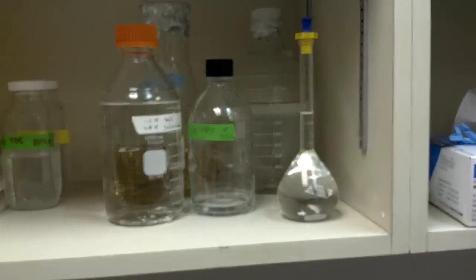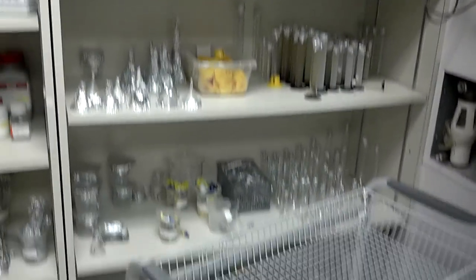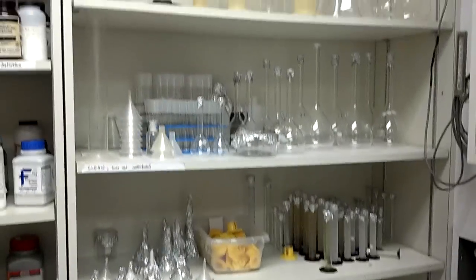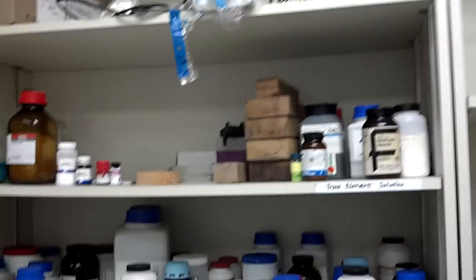This is my bench. As you can see, it's quite barren. My stuff here. And that's about it. All autoclave shit, stuff we have to use. Graduated cylinders. Stuff like that. More reagents. And that is that.